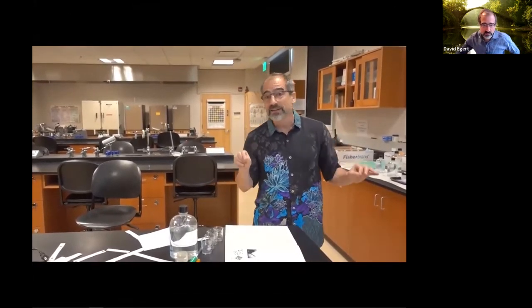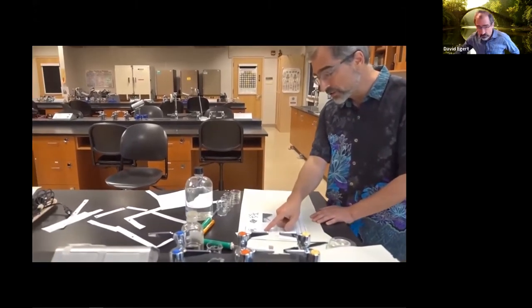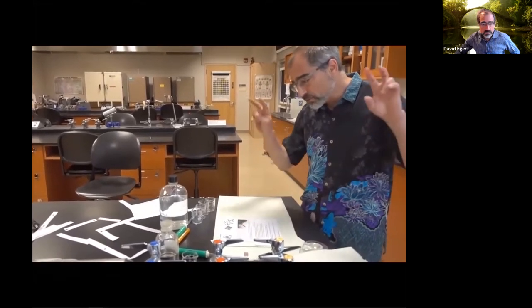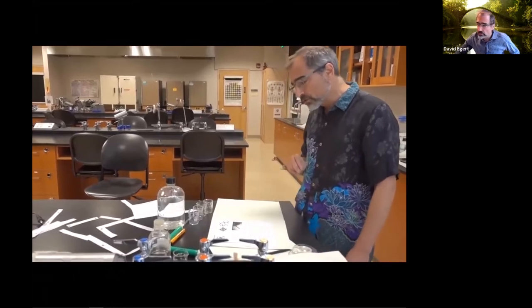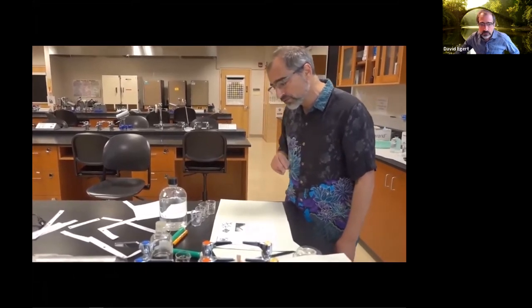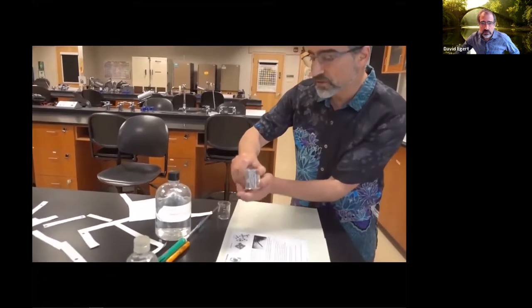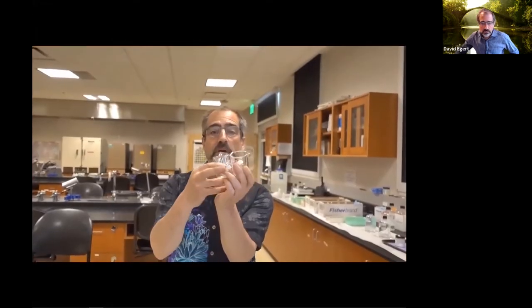Here we go. Have at least one person in your group who is the official reader and gets more pedantic. So I'm going to say part 1. Use a spatula to add small equal amounts, a large pinch of the dry electrolytes, sodium chloride, potassium chloride, and calcium chloride to 3 separate 50 ml beakers. So these are the little 50 ml beakers here. They're very cute. And we're going to put a pinch.